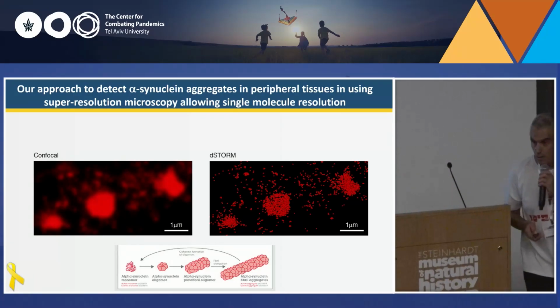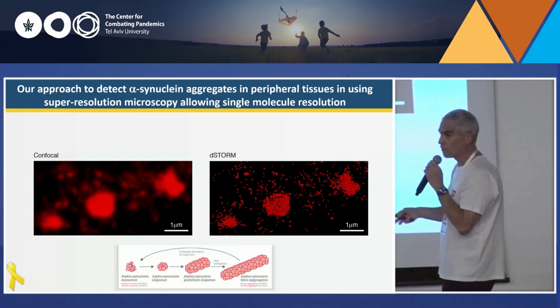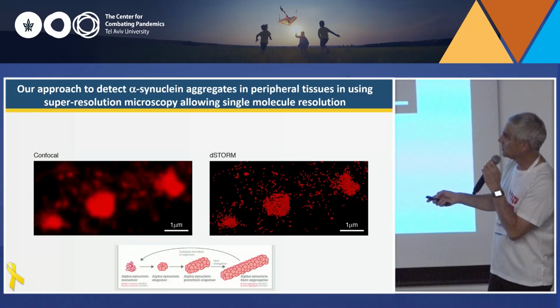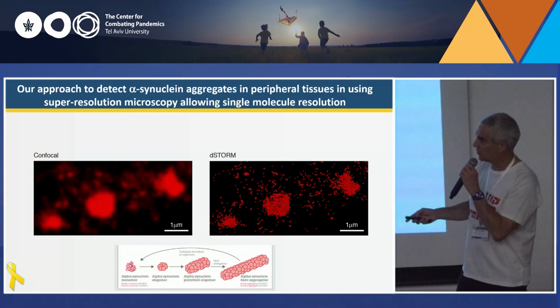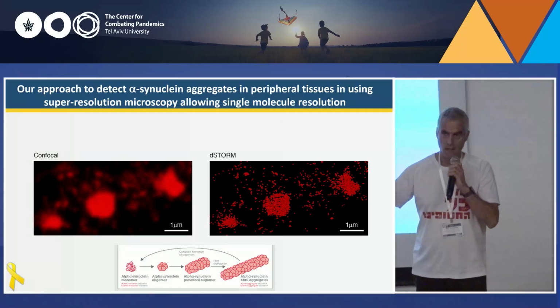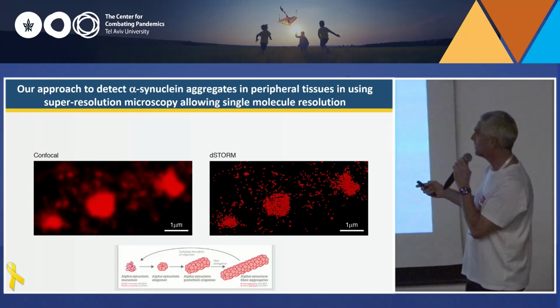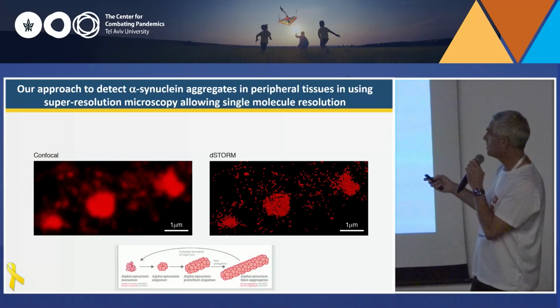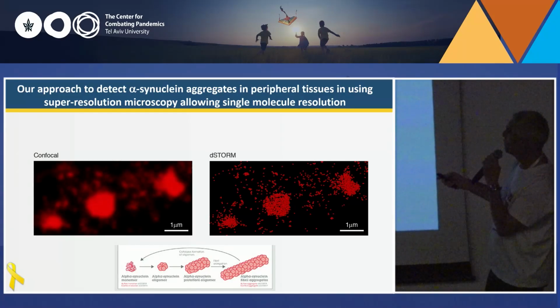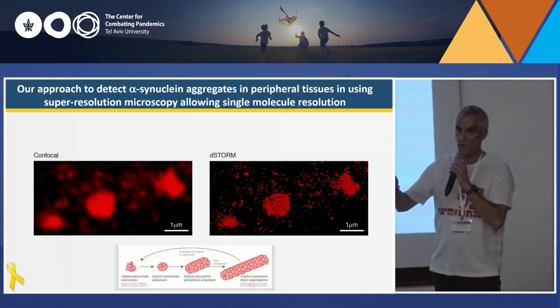That's much better. So when you take a confocal image, due to the diffraction limit of the microscope, you will always see some blur surrounding your protein of interest. Even if you have 1 or 2 molecules here, it will look like a 200 to 300 nanometer big structure. What we achieve using super-resolution microscopy, and specifically dSTORM, which I will elaborate in a minute, is that you can detect a single molecule, and you can detect that here there are 2 molecules, and here there are maybe 20 or 200, and they are at a density of X, Y, or Z.